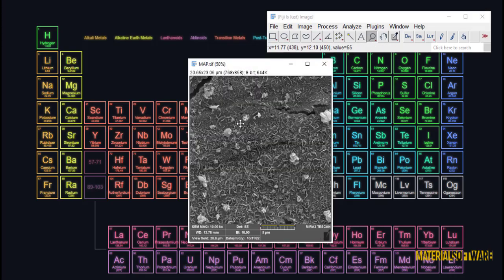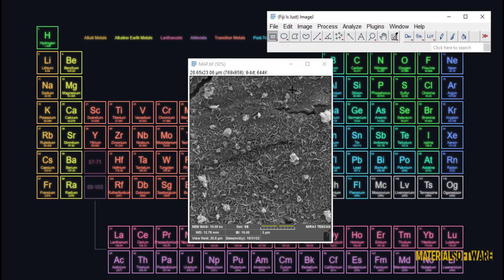So we go to the Analysis tab and set the scale option.